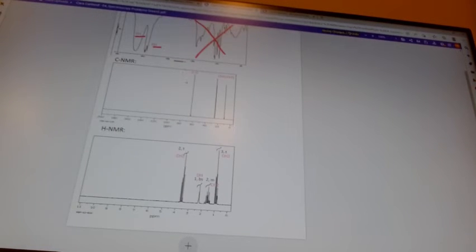Okay, so now on to the next problem. So I'm doing green problem number 2 for the next one. Okay, so for this right here, this curve is very indicative of an alcohol. And then this one, I was just like, it might be a CH, I'm not sure, but this is definitely an alcohol. I don't know what's going on over here. I'm not paying attention to this. I don't like it.